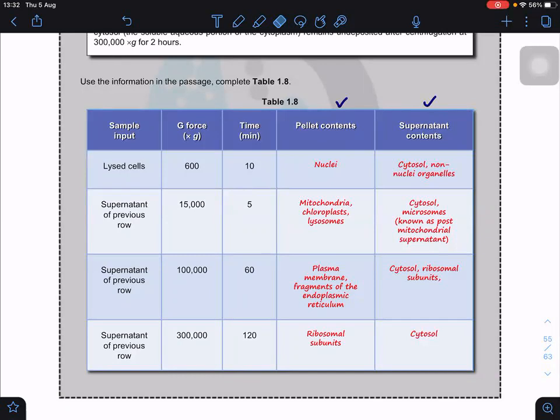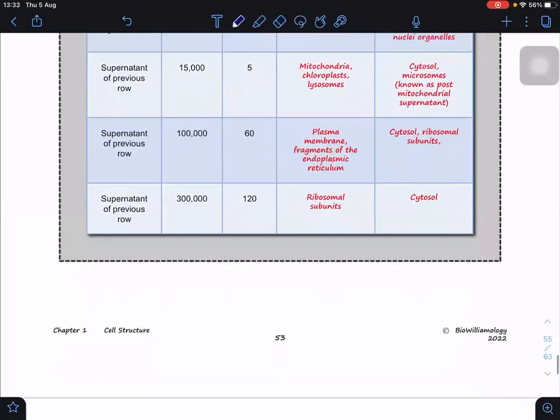Okay, supernatant basically means the liquid form. Pellet is more to solid already. Then the remaining. So for example, you can make a Milo. You let the Milo sink down. So this one is called pellet. Okay, in centrifugation, but Milo we don't call pellet, but generally you can imagine.